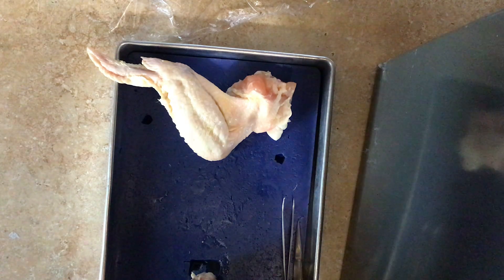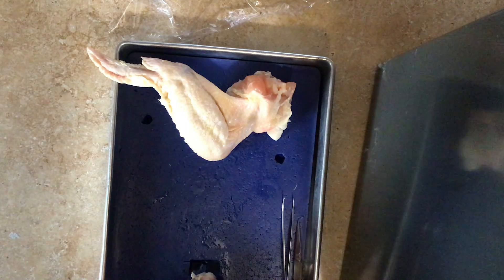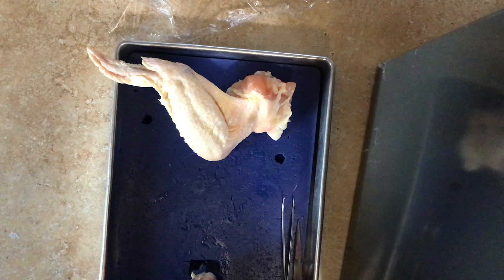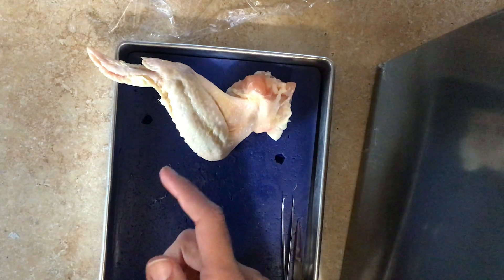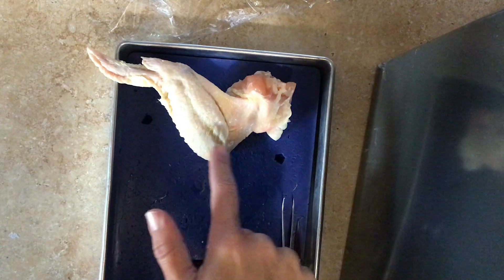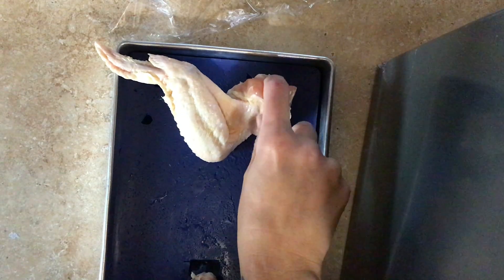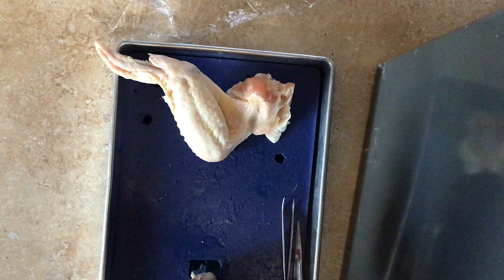I'll be taking you through the chicken wing dissection. You should read the first page — most of this is comparing the chicken wing to a human arm, and that's what a lot of the first page will talk about. You can see here this is the picture in the back of that first page of the wing tip to the lower wing to the upper wing of the chicken. This is where the wing would actually be connected to the chicken, and I'll show you that in a little bit.